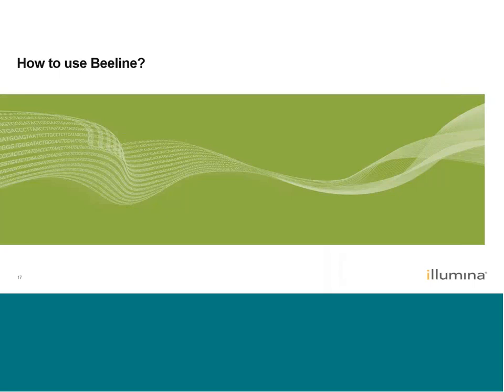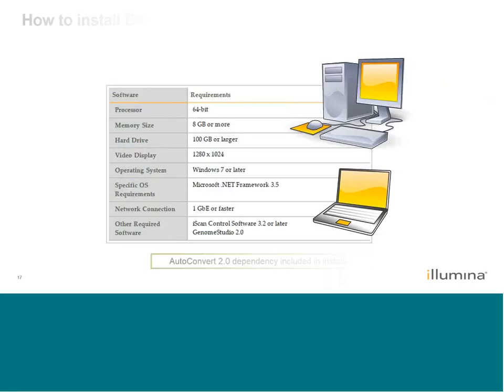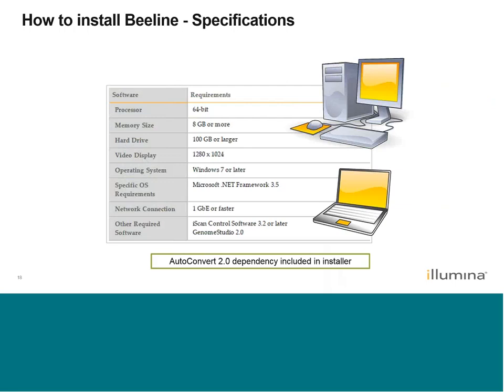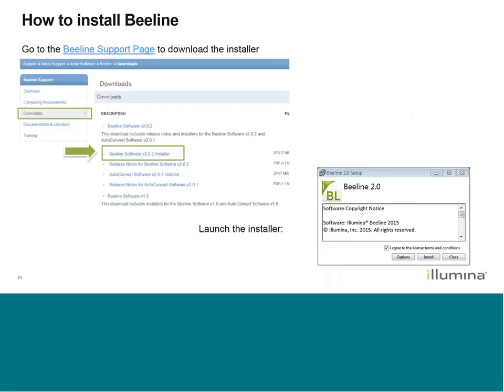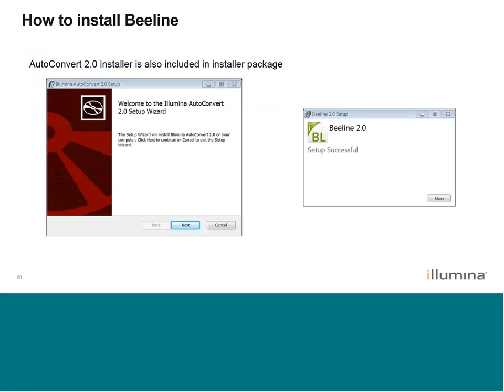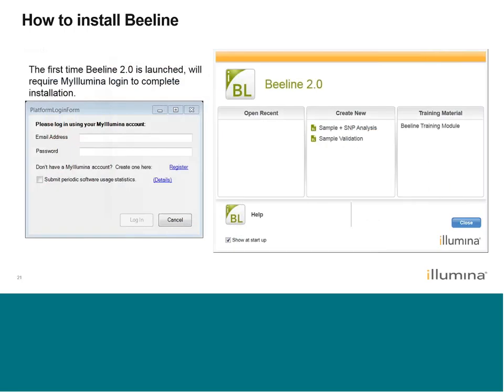Now we're going to go into some demonstrations of how to actually start using it. To install — the only thing to really note is that it is a Windows-only software. It's freely available on our website; just go to the Beeline support page to download the installer. Once you launch the installer, it will also run a dependent autoconvert2.0.exe installer that's included in that package, because Beeline uses the AutoConvert software to convert IDAT files to GTC files. Once both packages install, all you have to do is a one-time My Illumina login to authenticate the installation, and then Beeline is ready to use.